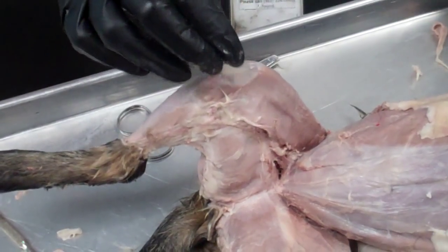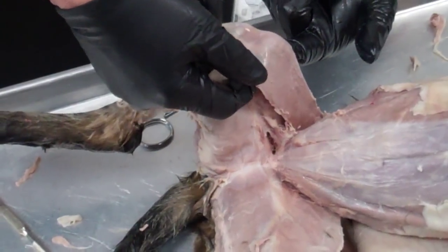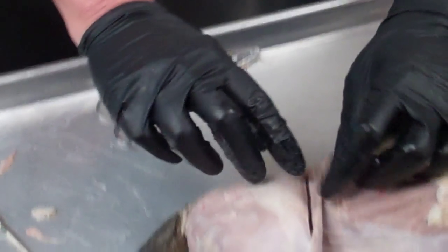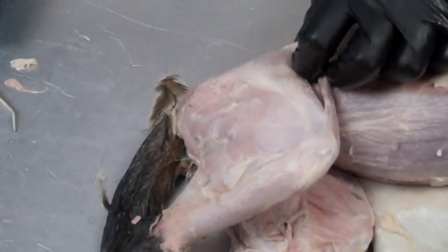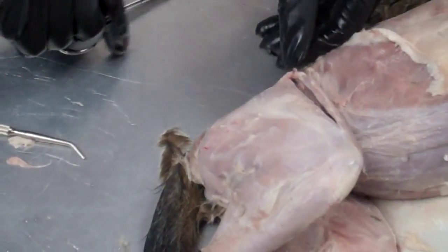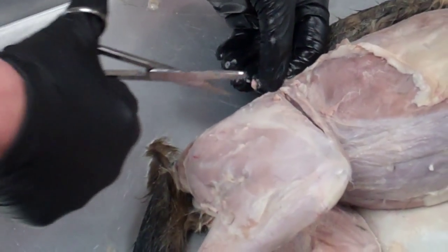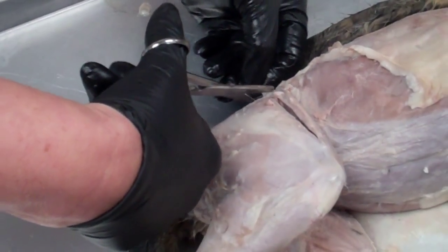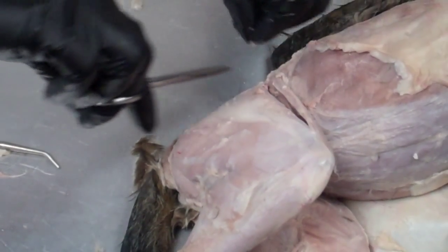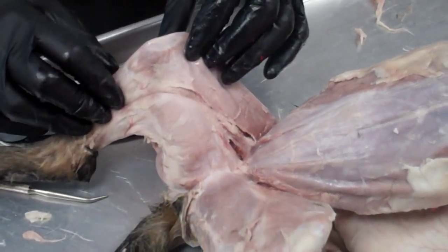If you have a little bit of fat, you can clean that off along with the fascia material. This first muscle goes from the leg up into the inguinal region. Sometimes in the back you'll see some fat material — you can remove that to get a nice clean separation. This is the sartorius muscle.